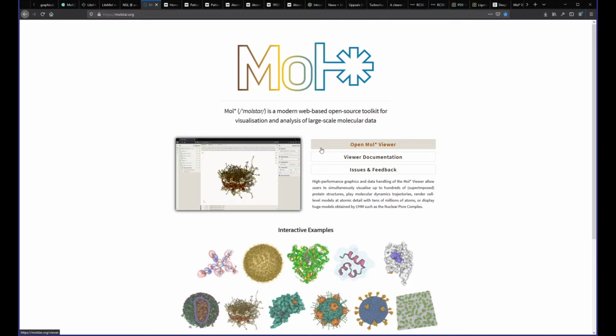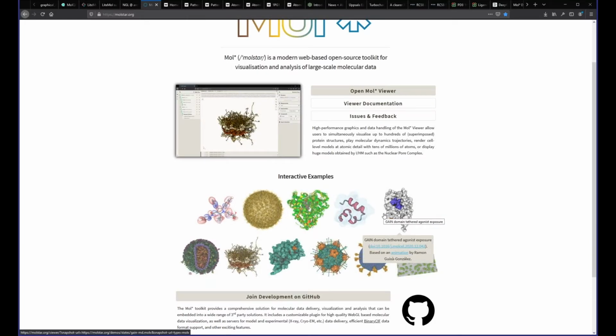We started working on this in 2017, and in 2018 we had the first working version. Over time, it was integrated into RCSB and PDBe, as you see now. And currently we have submitted a publication to NAR. Hopefully we will get it published soon. Okay, so I've spent some time talking about how Mol* came to be, so I think we can get to actually showing how it works.